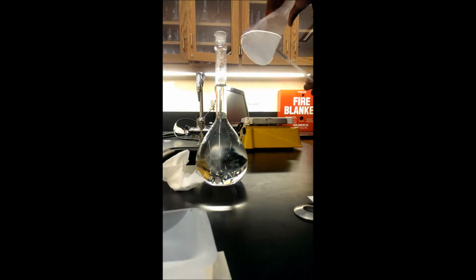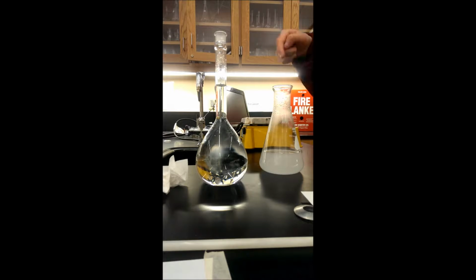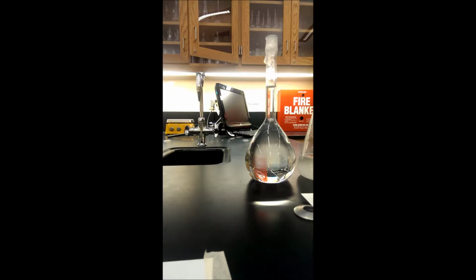And so here I'm just struggling to get the magnetic stir bar out of the starch solution. I was trying to do it from the outside and it was just weird. Turns out, you could just put the magnetic rod straight into the flask to get it out, so, awkward.